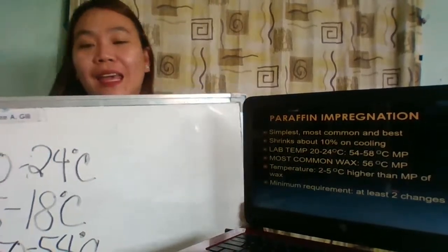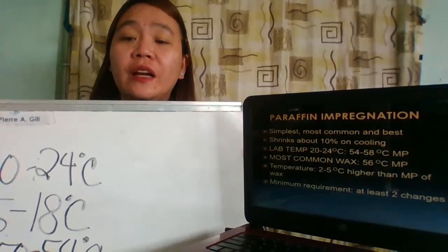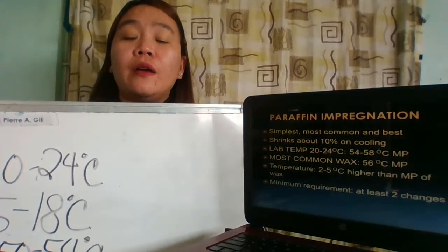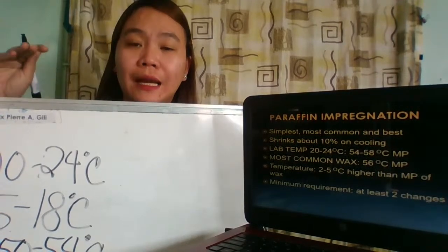We have a question from Miss Cherry May David. She asks, ma'am, what is 56 degrees Celsius? 56 degrees Celsius is the most commonly used wax in the laboratory.